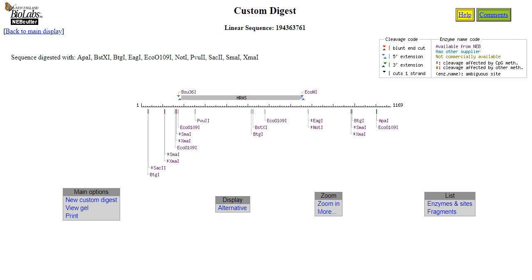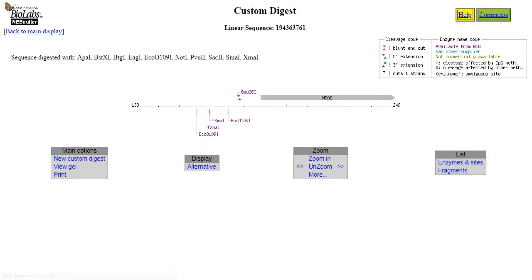So what's our next step? From the enzymes above, find one that's upstream of the open reading frame. So the open reading frame is right there. Begins right there. Now what's really killer is we can actually click right on there, mark it with an X, and go zoom in. And then we can see our choices.